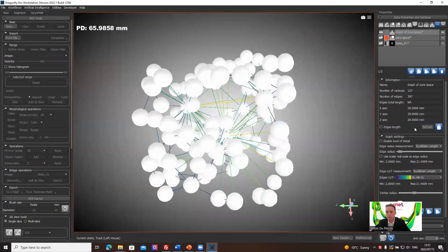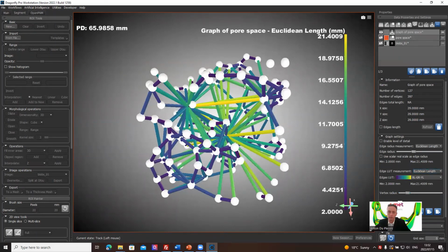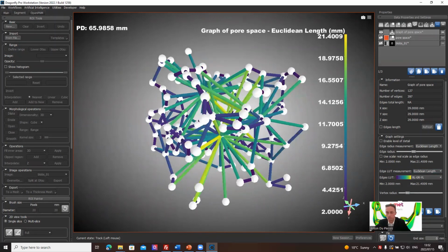This graph representation can be quite useful sometimes. This is mainly just to show where to find that. And you can map scalar values from simulations onto such graphs also.